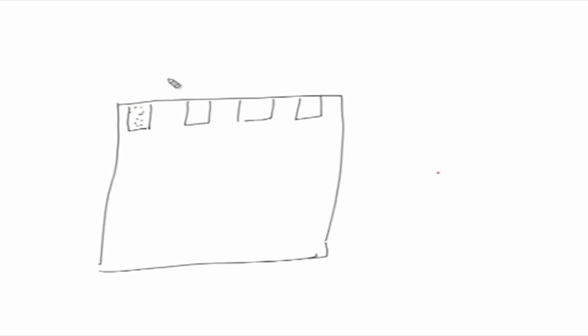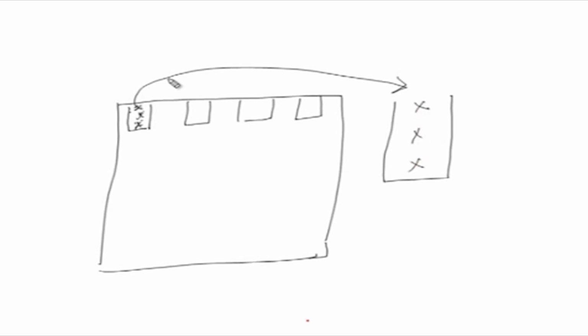Now, if I just show you this here, if I have a sample at this place and this place and this place, let me show it here. Say this is your well where we are loading the sample. Now you have a sample here, here, and here, and this is the boundary, or the interface, from where the sample is going to enter the gel.